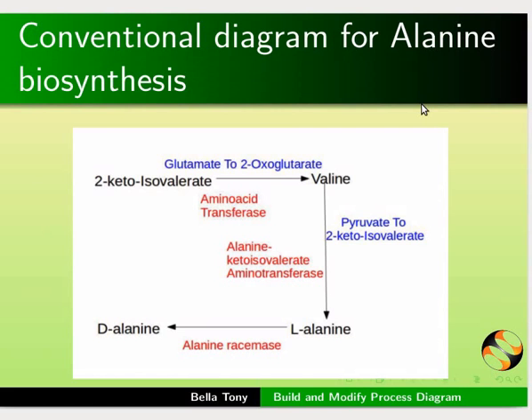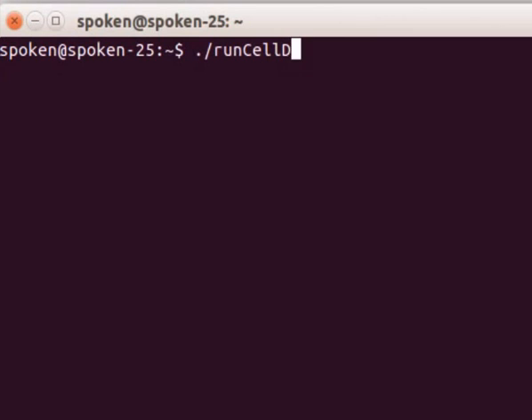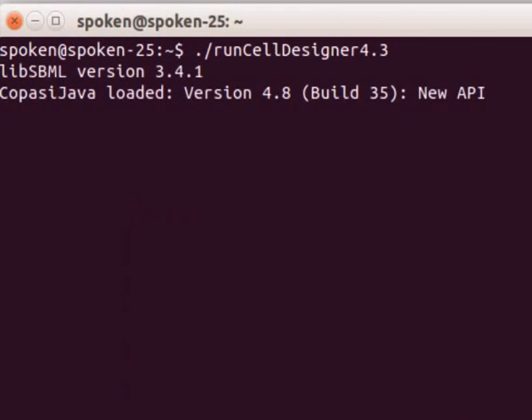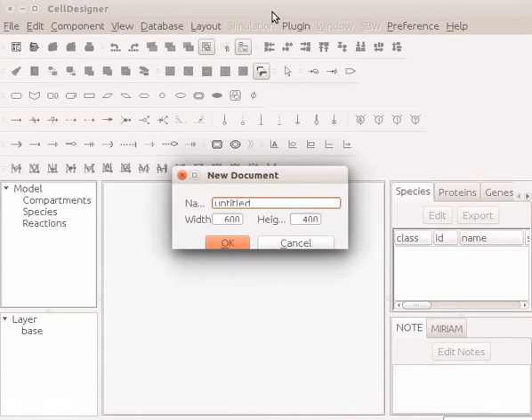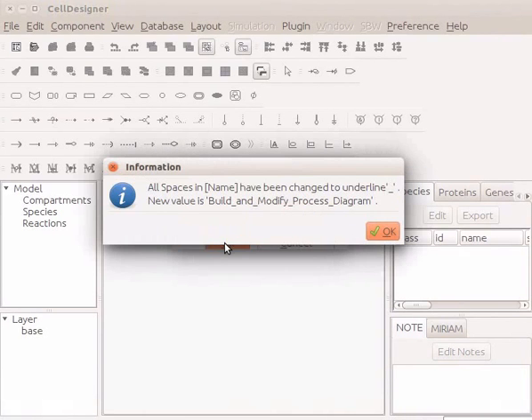Open the terminal by pressing Ctrl Alt T keys simultaneously. Now type dot forward slash run cell designer 4.3 and press enter. Cell Designer window is now open. Open a new file by pressing Ctrl N and name it Build and modify process diagram. Keep the default width and height and click on the OK button.